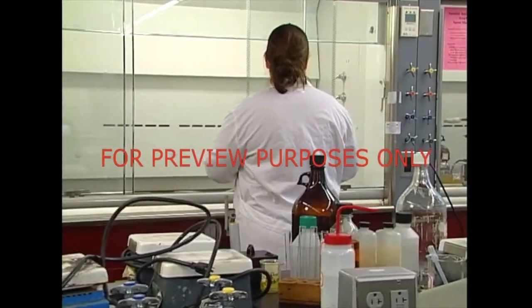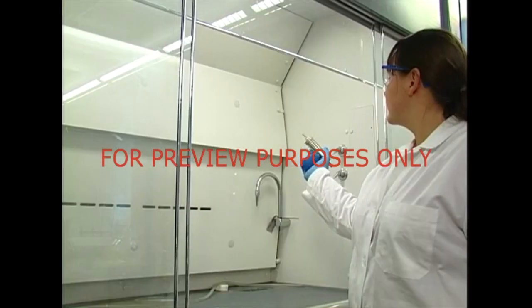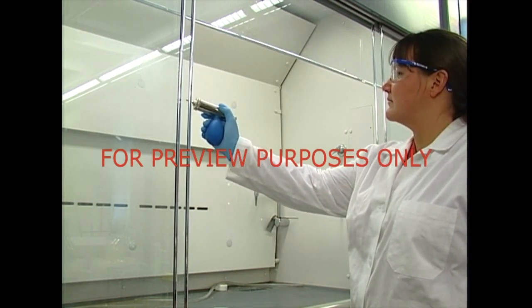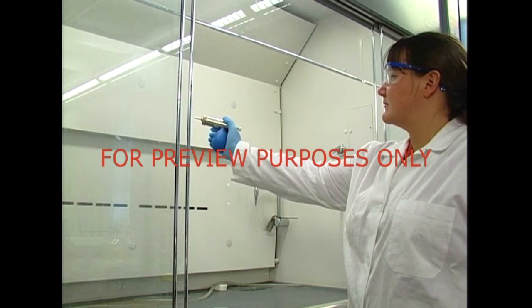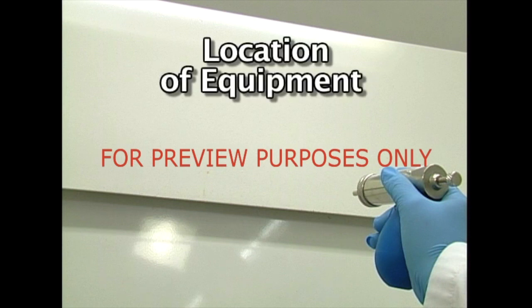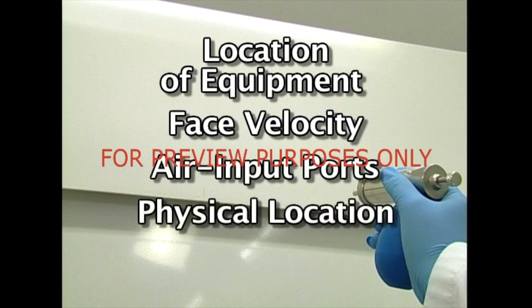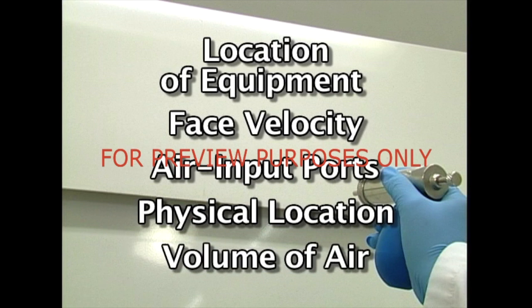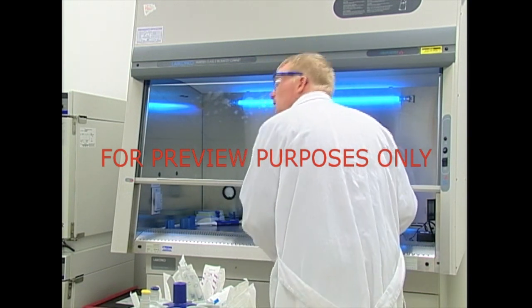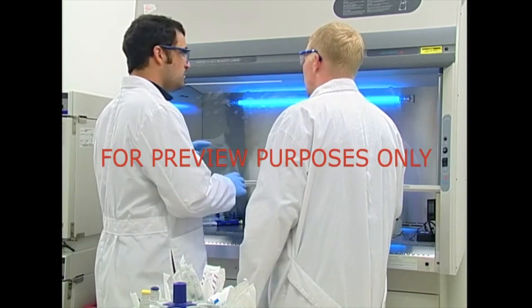Once it's determined that the air velocities in and around the hood are within accepted ranges, it's important to make sure the hood is relatively free of air turbulence. Turbulence can be checked by observing smoke patterns within the hood. If there's excessive turbulence or if the hood fails to capture the smoke, adjustments will be required. The engineer will consider changing the location of equipment within the hood, the hood's face velocity, the location of air input ports, the physical location of the hood, and the volume of air being brought into the hood. If you suspect that your hood isn't performing as it should, talk to your supervisor to determine if a re-evaluation is needed.